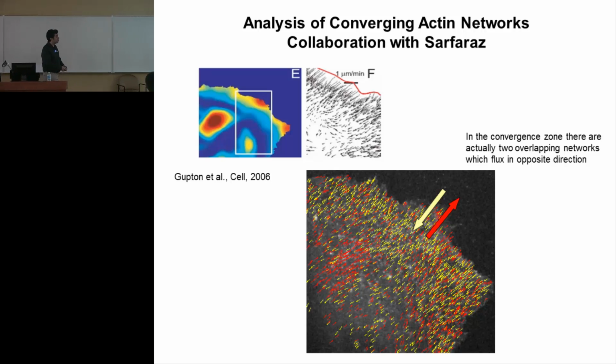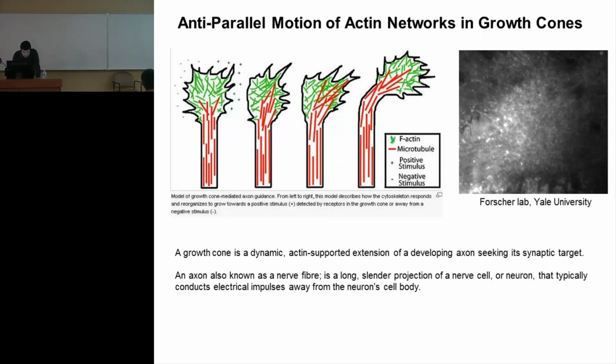In traditional methods, think for example of the nearest neighbor. When we have this network motion that you saw before that is anti-parallel, if the measurements are incorrect, we have a canceling out. So we have here the speed map. This is high speed, this is low speed. This is published in a previous paper with another tracker where the convergence zone is not correctly tracked. So this is one objective I wanted to see here with your lab, to see if we can have different trackers and different approaches to dissect these anti-parallel zones of converging networks.